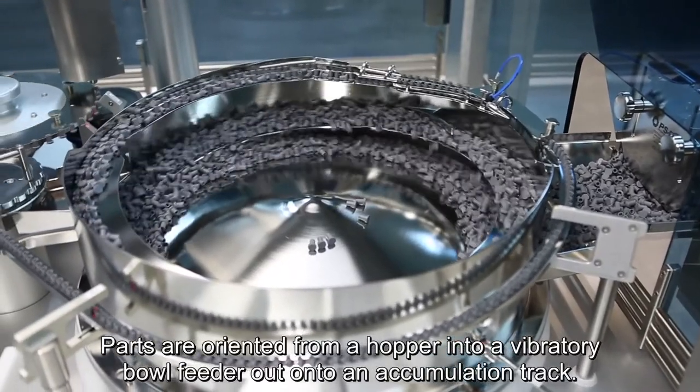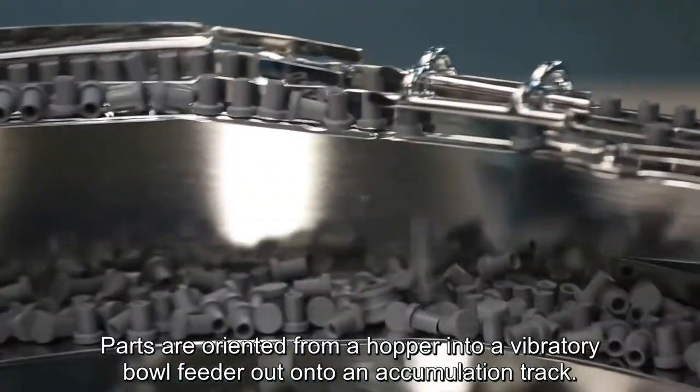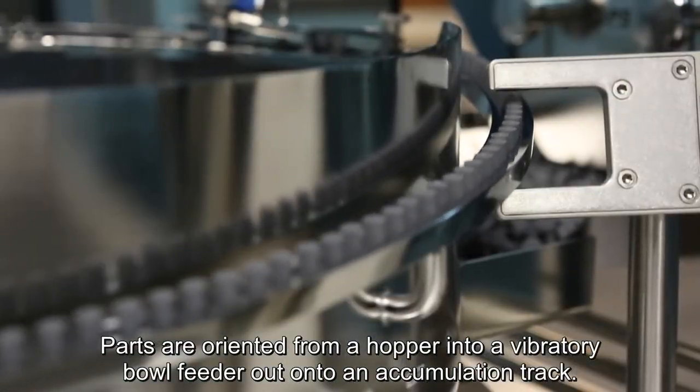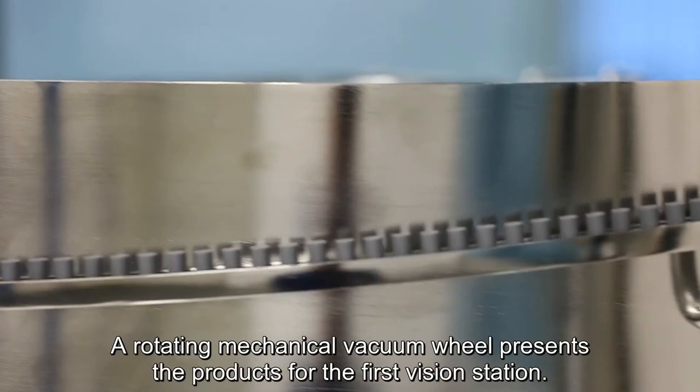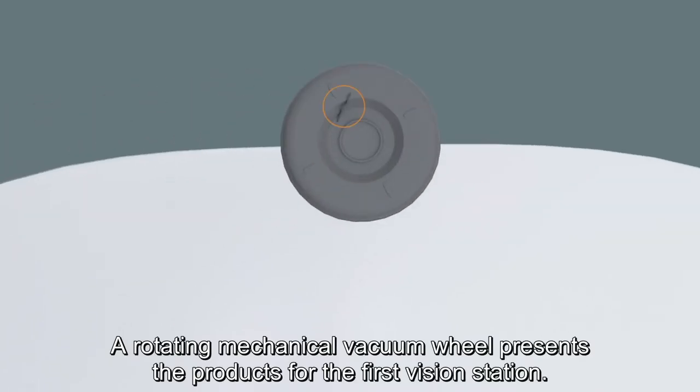Parts are oriented from a hopper into a vibratory bowl feeder out onto an accumulation track. A rotating mechanical vacuum wheel presents the products for the first vision station.